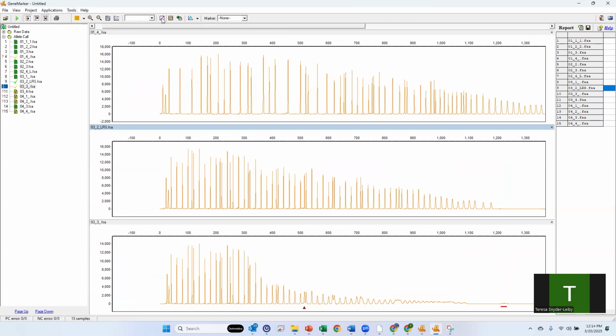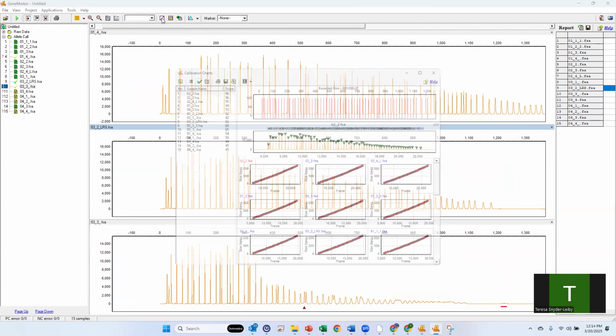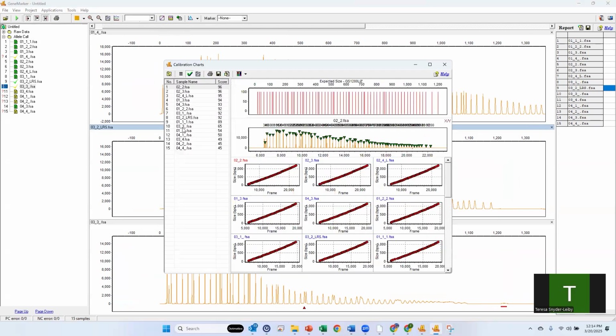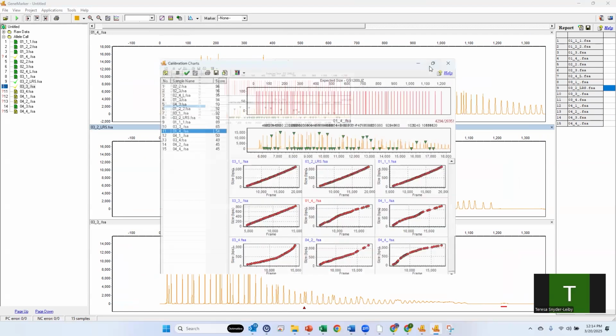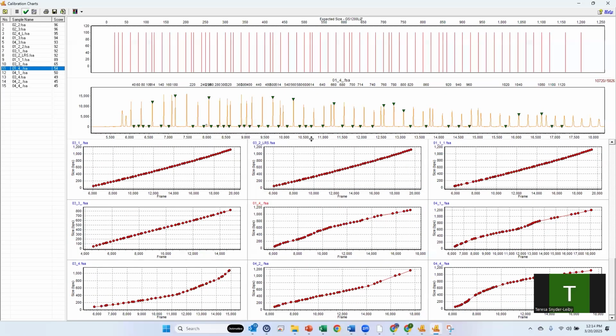Okay. So that was one where we just had to add some that were out of the expected range. I'll go back now to the one that was more severe looking, sample 4, Sample 014. Here it is. I'm going to make the screen larger here so we can see. It's finding areas or blips in the baseline that are a better match to this.